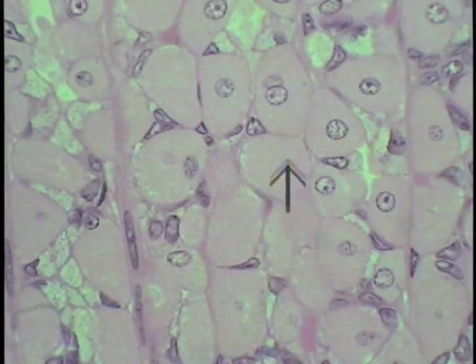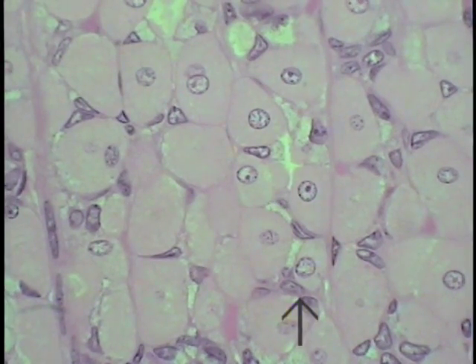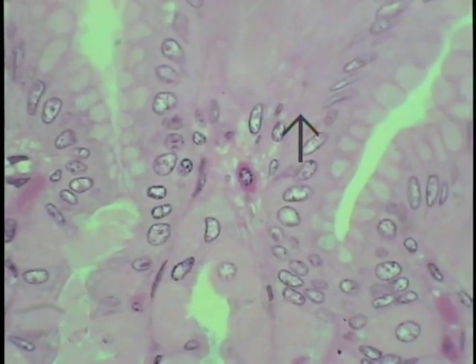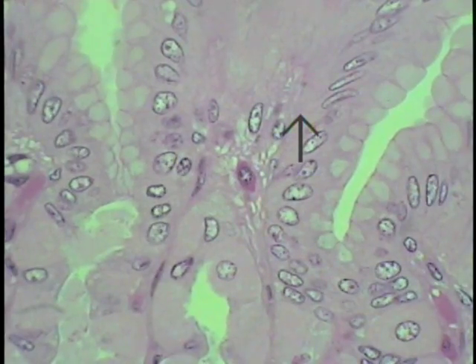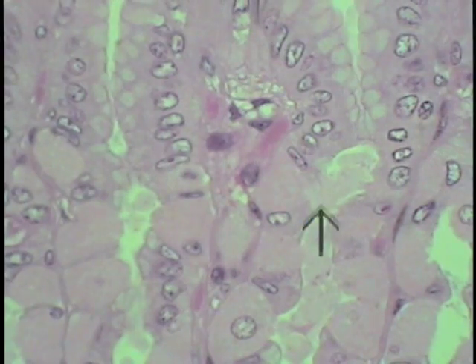characterized by that acidophilic cytoplasm due to the tremendous number of mitochondria contained within these cells that take up the eosin dye. And these are examples here of the mucous neck cells. And finally, we should be approaching the surface, and indeed we are, showing that the glands empty into the bottoms of these gastric pits.